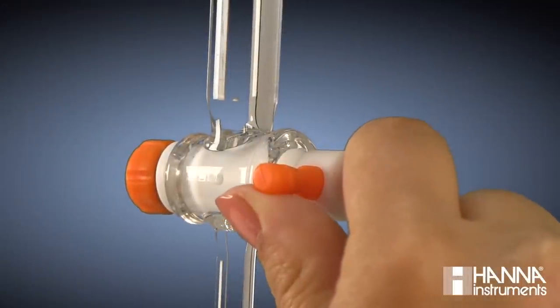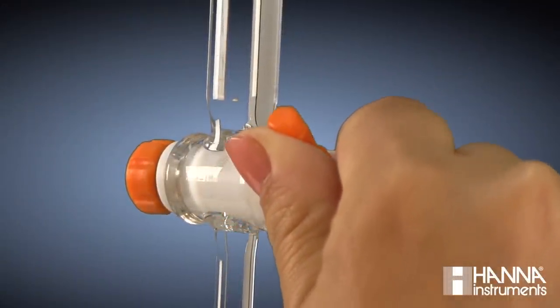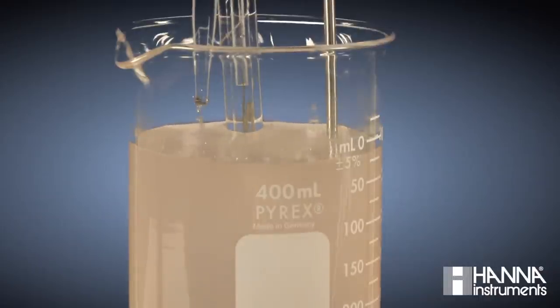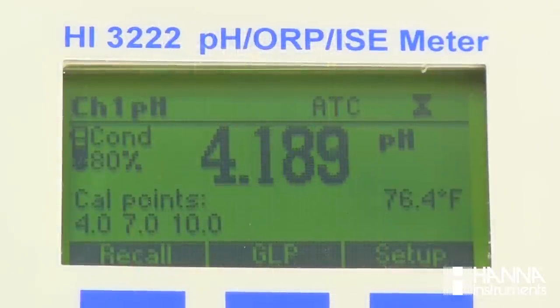Now, we can open the stopcock and begin dosing our titrant in the sample. Initially, as we add our titrant, we see that the solution remains colorless with each titrant dose, and our pH is changing relatively slowly, only in the hundredths for every drop added.